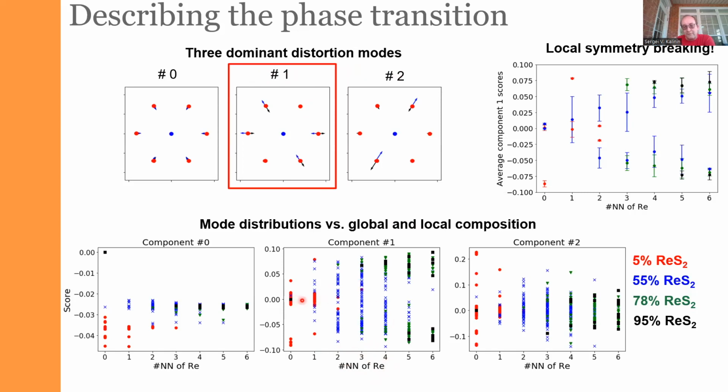And you can see that virtually for all our materials, if we have 0 or 1 atom, we don't have a splitting. And then if we have 2 or more, then we start to split our local neighborhood, which basically means that if you apply electron microscopy combined with relatively simple image analysis, you can actually start to study the symmetry breaking on the level of single atom.